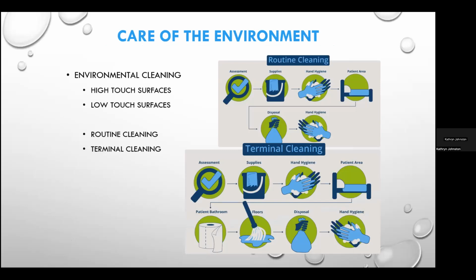So when we speak of care of the environment, we talk traditionally about the environment of care, that is the patient's areas, but these principles also apply to the laboratory, at least as far as routine cleaning goes. So we are going to talk about it with that component in mind.